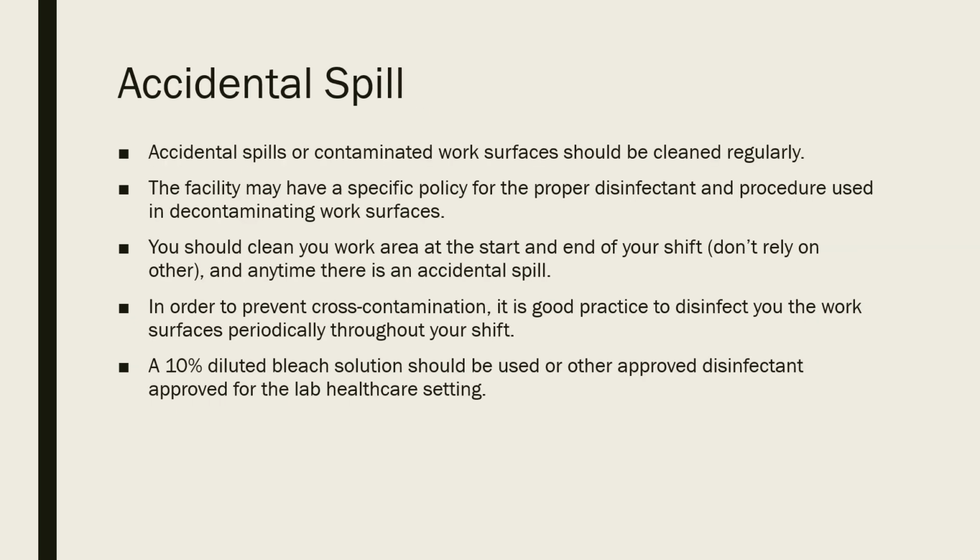Accidents do happen in the laboratory. You know, we're all the time spilling something. Maybe you're transferring a specimen from one tube to the next and you spill a little bit. This is going to contaminate your work surface. So you need to make sure that you're always keeping your work surface disinfected. You don't want to be using dirty pipettes because you didn't properly dispose of them. You need to make sure that your area is clean before and after your shift. You cannot rely on others to do this.